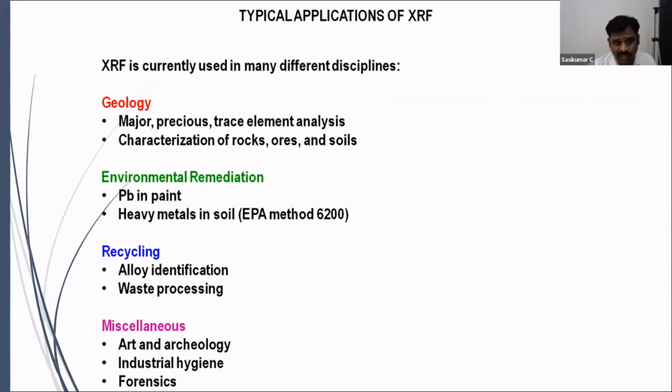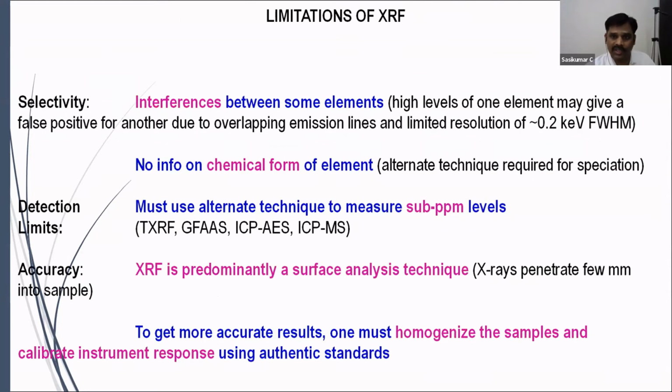So XRF is a powerful tool, relatively easy and convenient for a researcher to identify the chemical composition. You can use it for geological applications, environmental applications, or recycling of metal or waste materials, and many other miscellaneous applications like archaeology and forensics also.